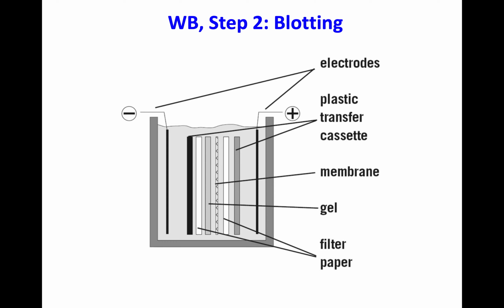So that's a special thing about protein. Everything is done vertically. When it is done in an upright position, it is usually much better. But having said that, in the old ways, before we had the machine for this, Western blot was also done horizontally, but it's not a very efficient transfer. So that's why they developed a machine. Using electrodes, the transfer is actually much better.